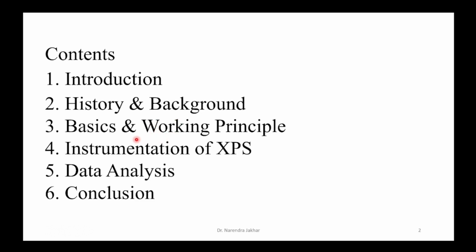In this content, we will take different examples of the basics, ranging from the photoelectric process to Auger electron emission and the different equations used in XPS, and a few more examples to get an in-depth idea of its working, followed by the instrumentation of XPS.